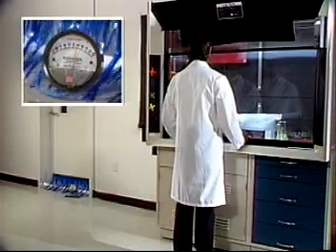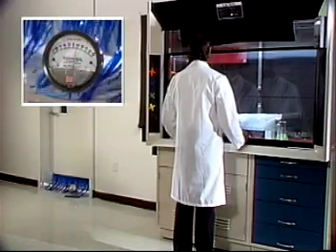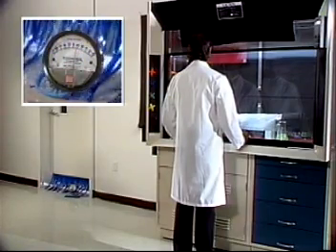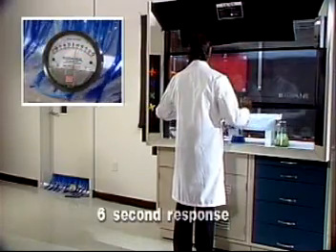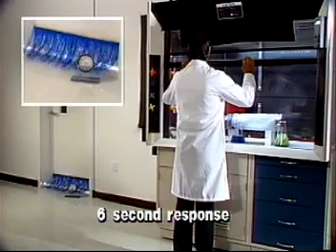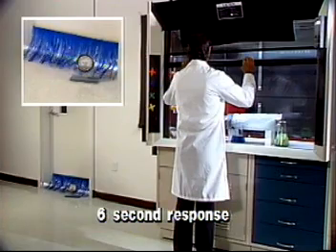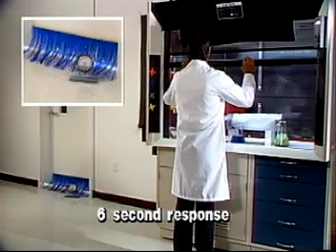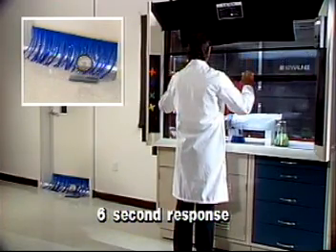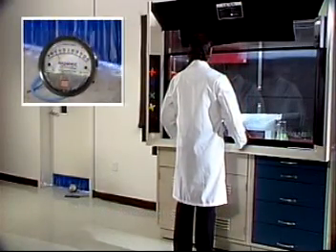Now we will filter the control signal to simulate a 6-second response delay in the tracking of the room supply to the hood exhaust. Notice that when the sash is raised, negative room pressure increases noticeably. This unstable situation can also affect relative pressures in the adjacent corridors and rooms. When the operator lowers the sash, the room pressure changes to a potentially unsafe positive state.